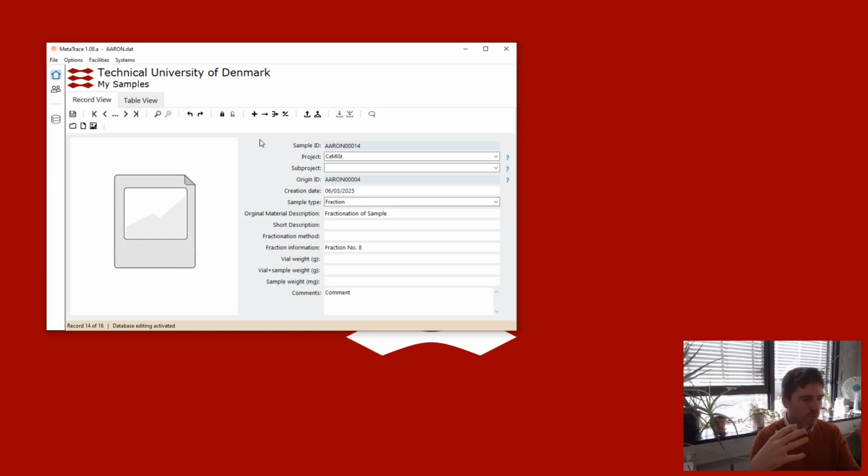So, for example, if you could imagine someone goes out into nature and picks up an environmental sample that's got one ID. From that environmental sample, they isolate a strain through multiple culturings. So there's a couple more IDs there. They deposit that strain into a library.